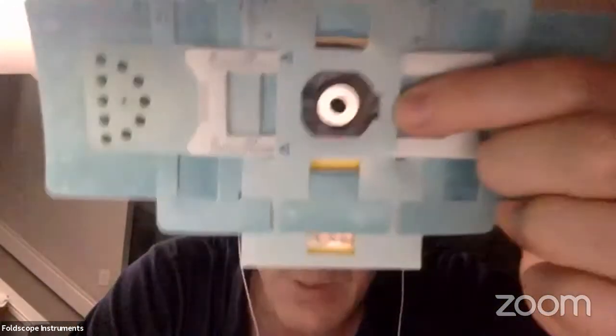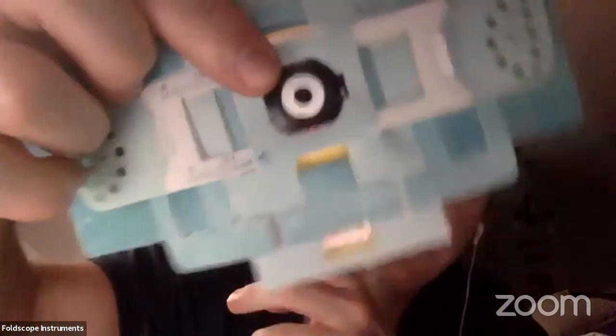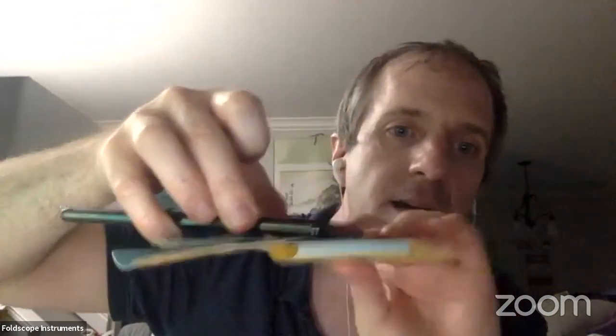We embed that in a plastic aperture. The aperture that we're using is formed from a carrier tape. I don't know if you're familiar with carrier tape, but that's used in the electronics packaging industry for carrying different LEDs and surface mount components. We developed a custom design for a carrier tape that essentially serves as the mounting element for that lens. And then the thing that looks like a washer on there is actually a ring magnet. If you have another one taped fast to your phone, you just bring them to each other and it clips right on and automatically aligns.